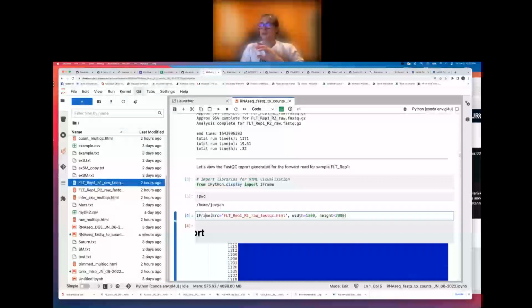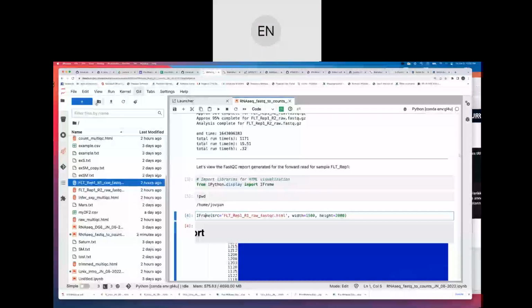How do we get back to that root folder? I click on the folder and it doesn't seem to get me there. Okay, I did it now. Awesome. So I see the reports are there. Good.